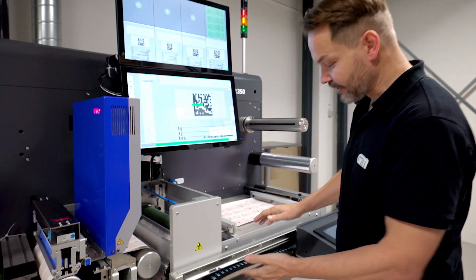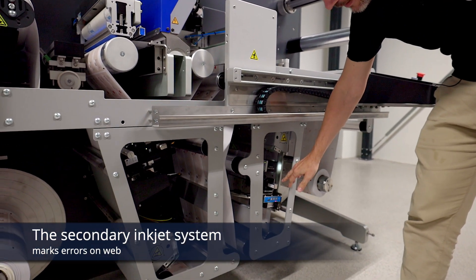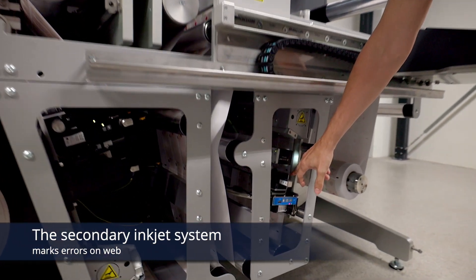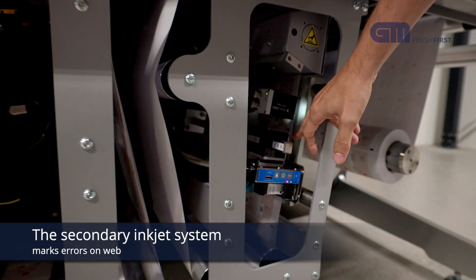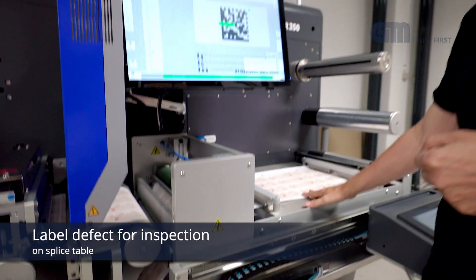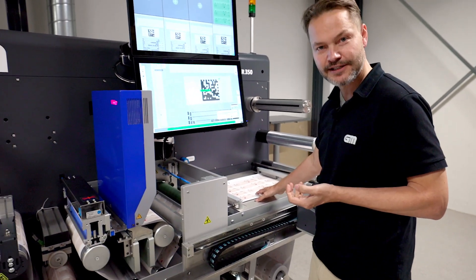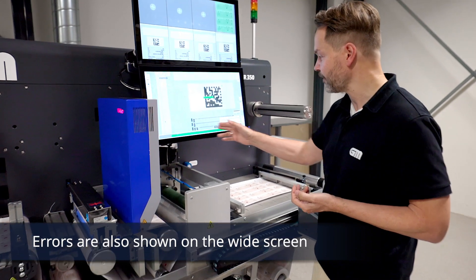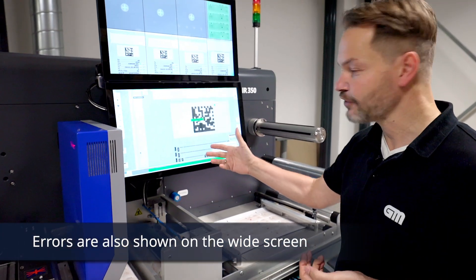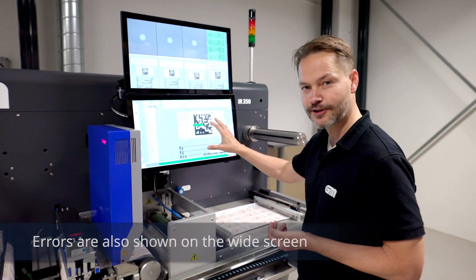After that, if there is an error, there is a secondary inkjet system that will mark just on the side of the web — it will put a dot down saying there is a problem with this label. It will then place it up here on the splice table for the operator to inspect or replace. It will also be shown on the graphical user interface so the operator can clearly see what is going on.